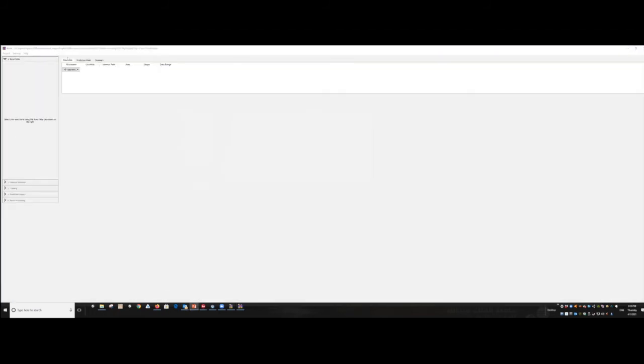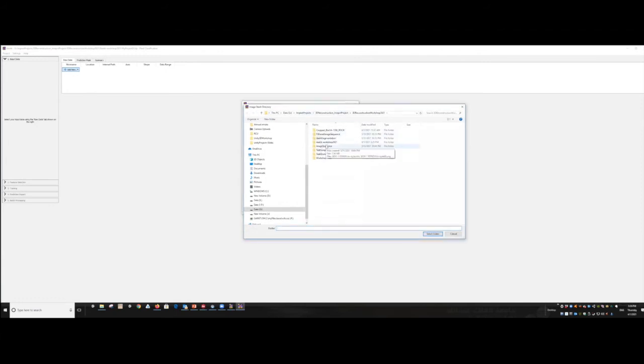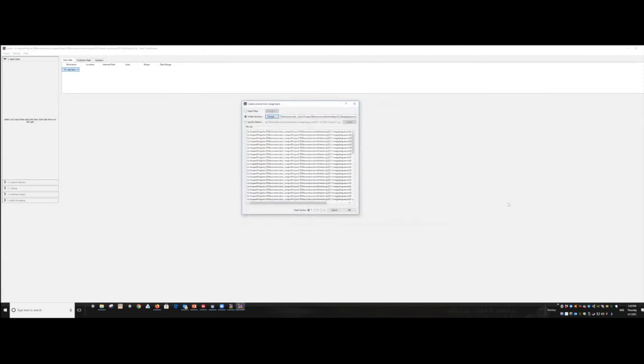Save. So right now, what I'm going to do is import the new data, the raw data in. Where it says here, add new, I'll click on that and add a single 3D or 4D volume from sequence. And I'm going to select the whole directory, choose. I have it here saved as image sequence. That's the folder. It's just going to drag all the images that are in that folder. Select folder. And over here where it says stack across, we're going to change that to Z. And click on OK.